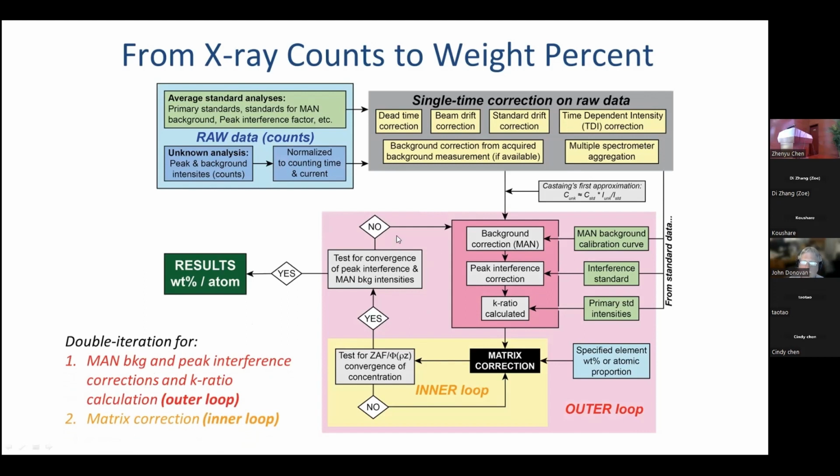It's the same problem. This procedure is true regardless of whether you're doing pixels or points. It's the same thing that's applied. And as I will show you, we do this method for quantitative pixels and quantitative points.